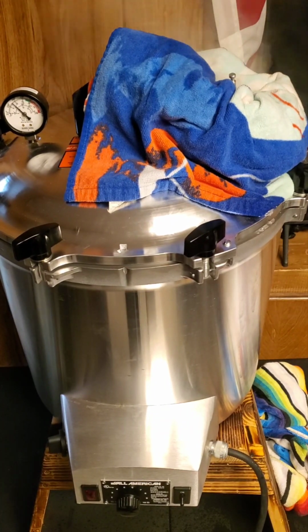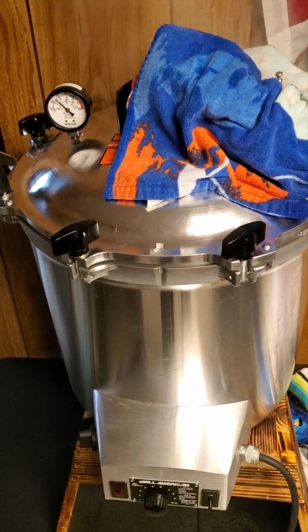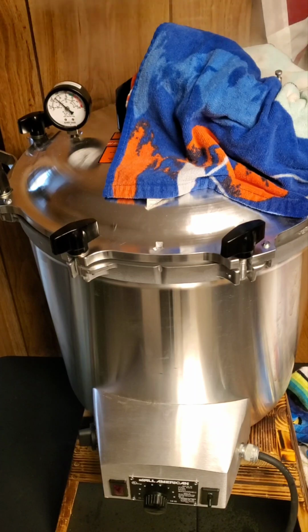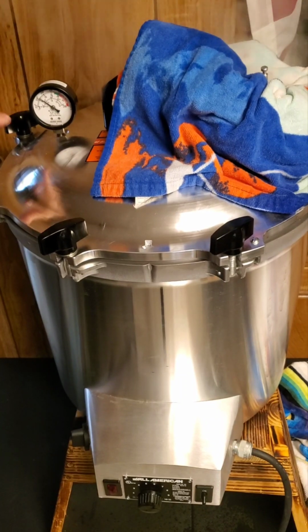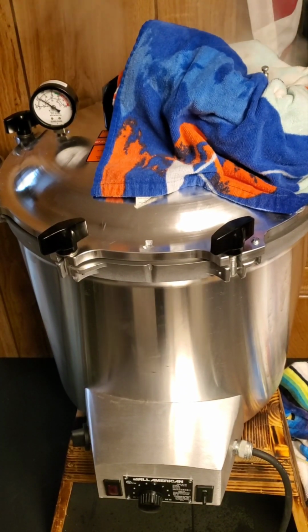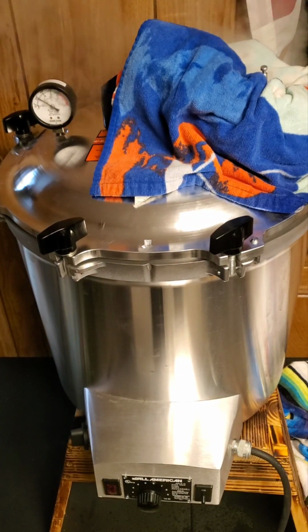You can smell that bird seed. I'll be looking to switch to 100% organic rye berries and source those, honestly. Or 100% millet, whatever I can get the cheapest price on. The bird seed's super cheap right now, too. See the pressure going down. But yeah, I recommend having some old beach towels ready to soak all that moisture up. I always keep several on standby just because we're dealing with water. Between this and refilling the humidifier.